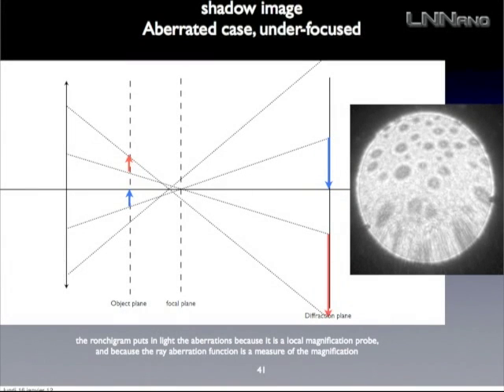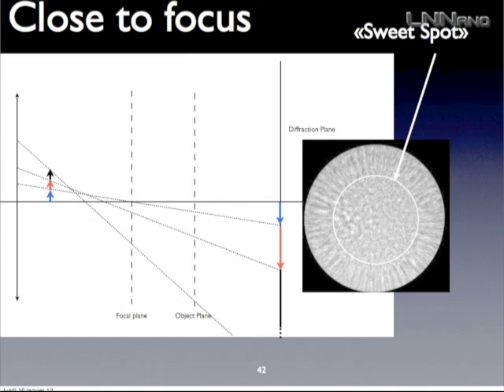And of course, here it's on a dedicated machine, but on the JEOL that you have here you can make this kind of measurement. Not for coma, which is too high an aberration, but you will see how spherical aberration can be detected. Okay, so this is here. So now you are getting closer to the focus. Okay, and so close that there is at least one object, say this one. Sorry, so the focal plane is here.